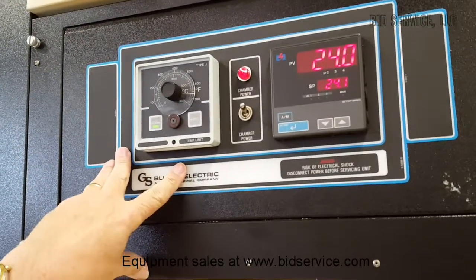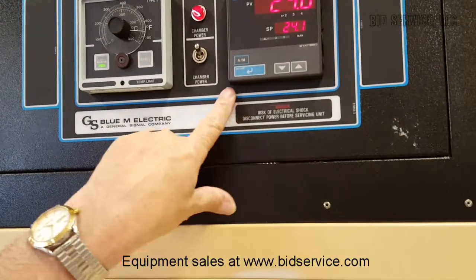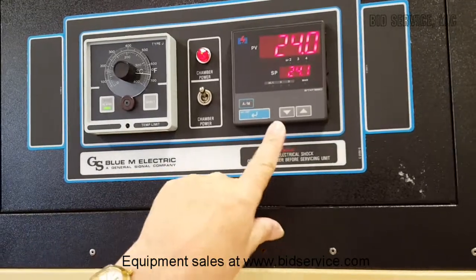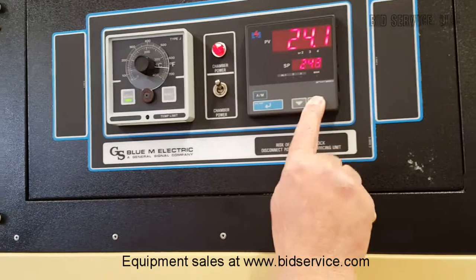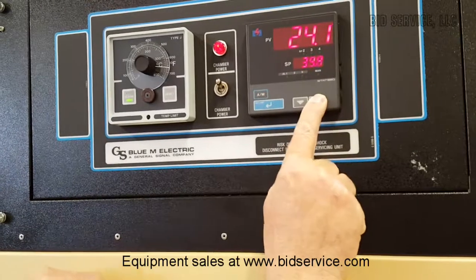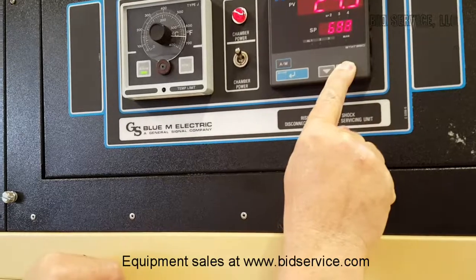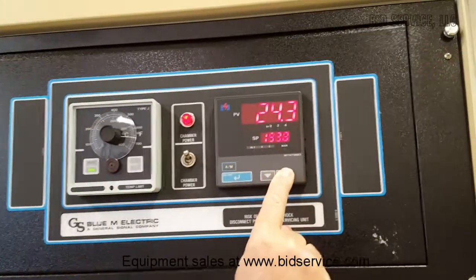This unit can heat from 15 degrees above ambient to 316 degrees centigrade. I'm going to increase this. While those numbers are ramping up — this is set for PID control.